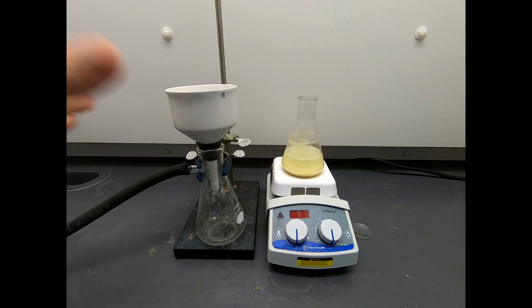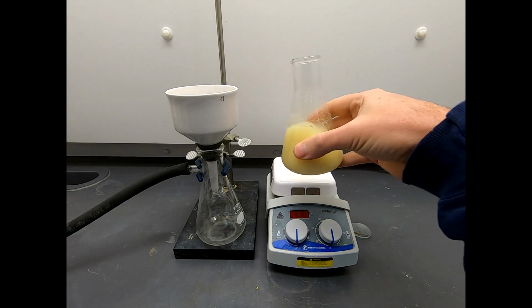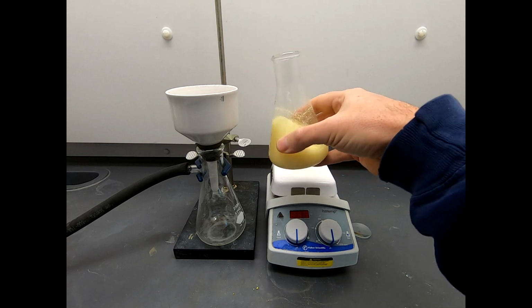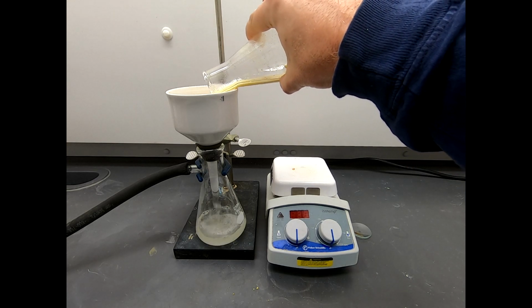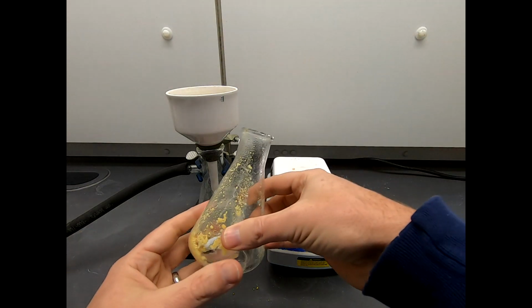Turn on. I'm not sure if you can hear that suction, but we're getting good suction there. That's nice. And I will just swirl this to get this nicely suspended. I'm going to pour this in. I'm going to try not to pour the stir bar, but I'll see if I can be patient enough. Okay, that looks great. Oh, there are some pieces. See, you can't avoid the pieces, but that's okay.